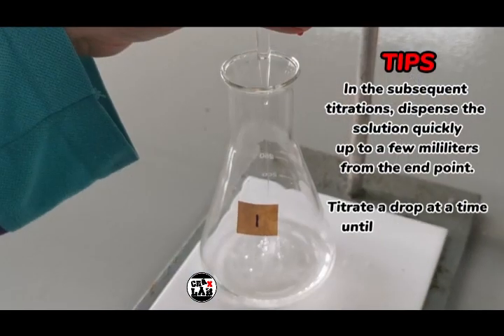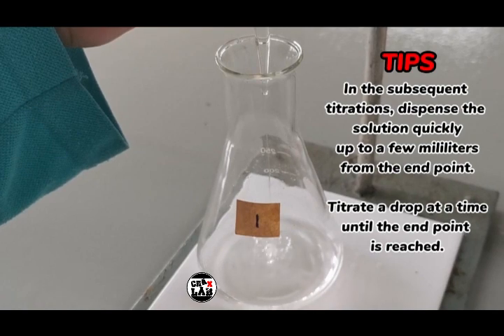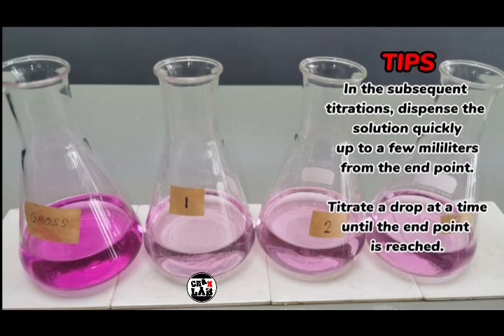In the subsequent titrations, dispense the solution quickly up to a few milliliters from the end point. Titrate a drop at a time until the end point is reached.